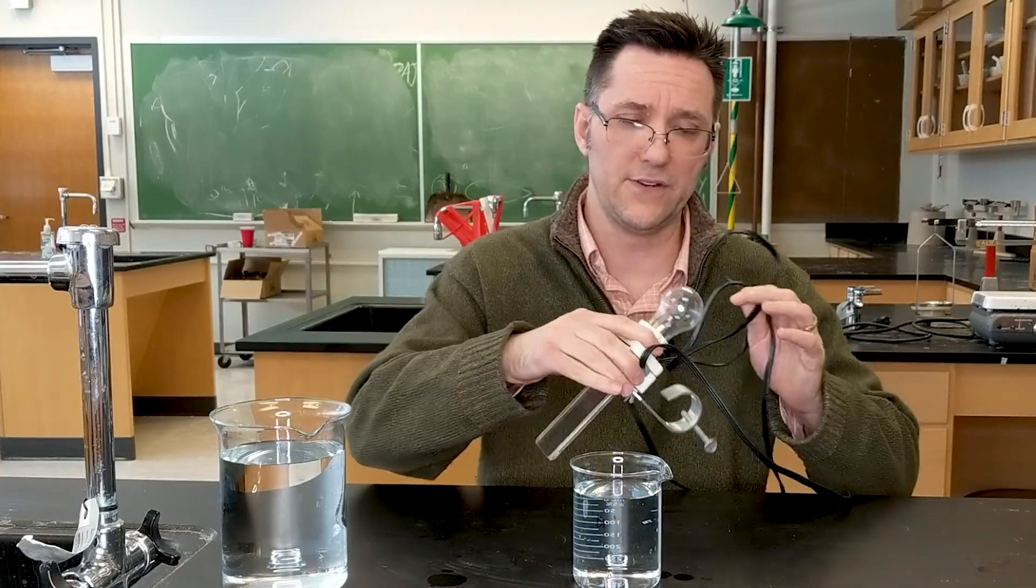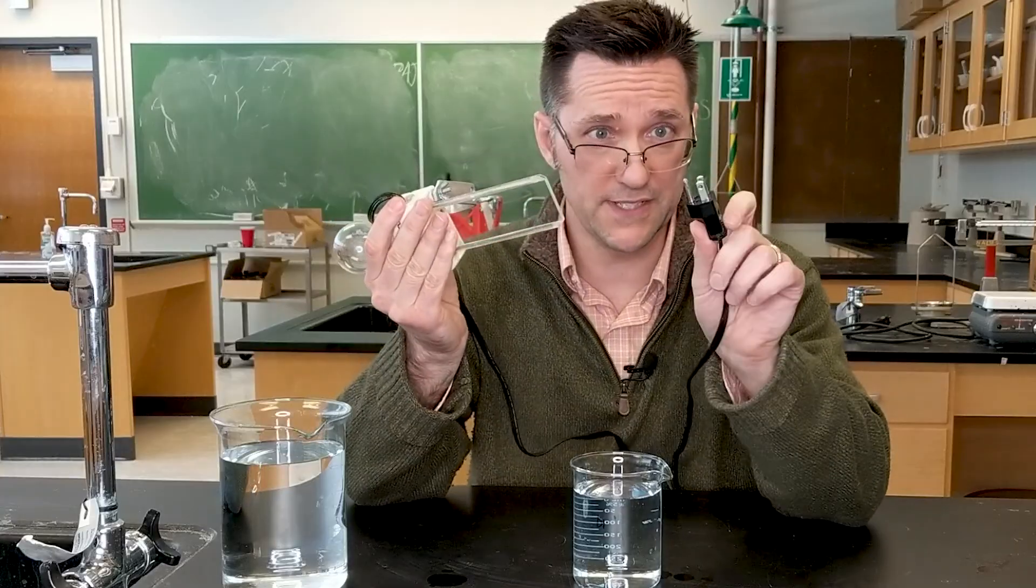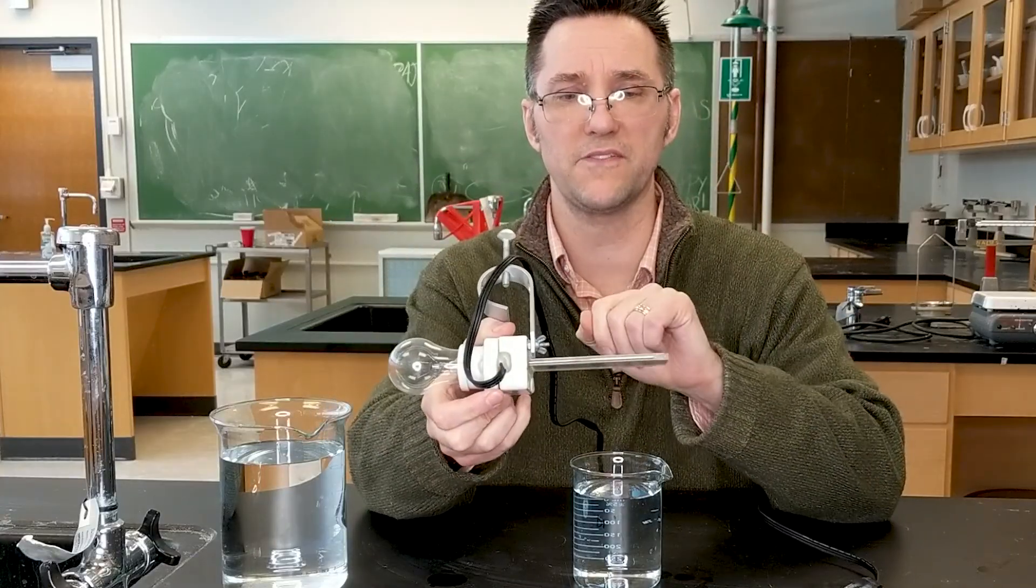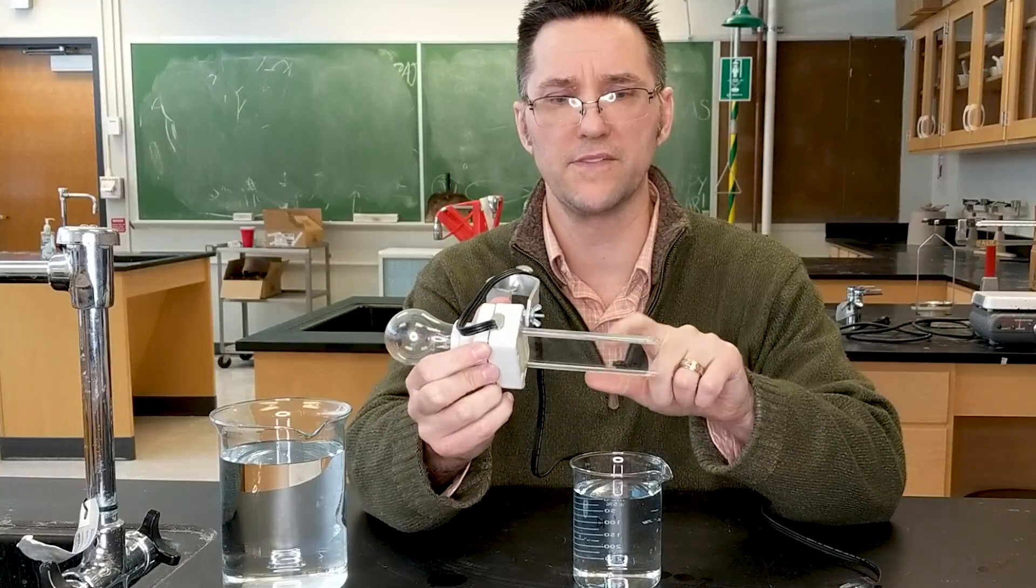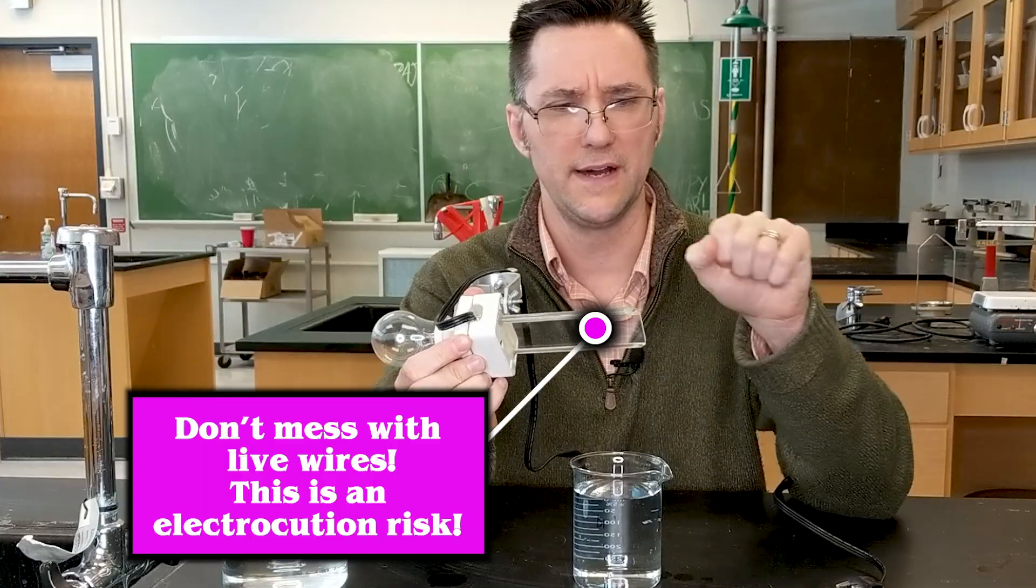I'm going to be using this little conductivity tester. What it is, is essentially just a light bulb. It's got a plug just like anything else. You can plug it in. What makes it different is that you have exposed pieces of metal here and the circuit is broken. It's protected by this piece of plastic to keep me from grabbing on and electrocuting myself once it's plugged in.